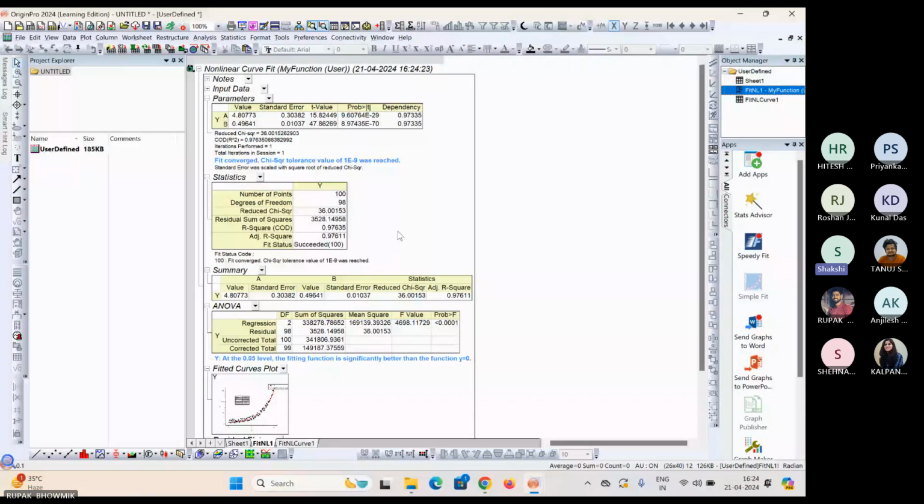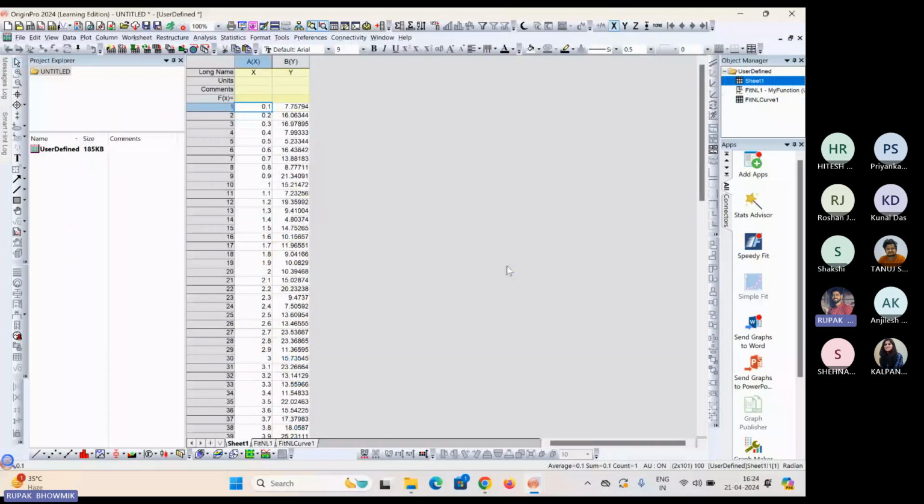Yes. So this last question is not getting clear. I have created an analysis workspace, something like a template. The calculations I have done here are a non-linear curve fit. Once you have created a workspace, you can import any data. Without doing any calculations, you just need to import the data and the auto recalculations will happen.